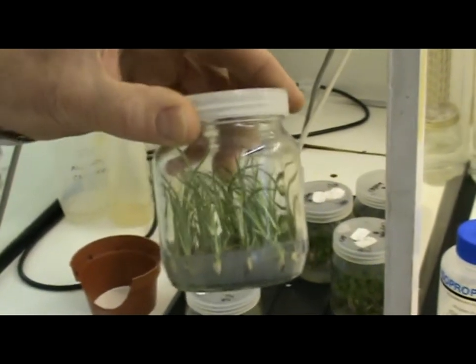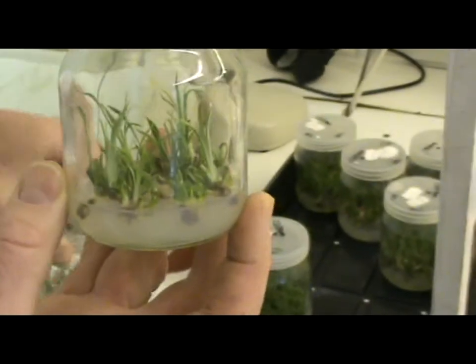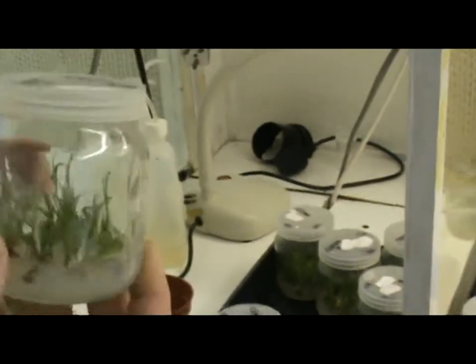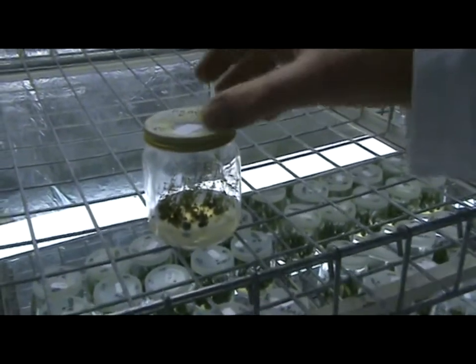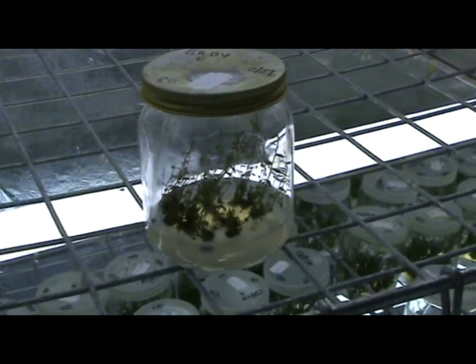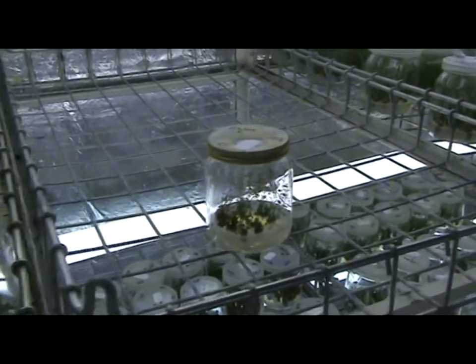I wonder if you could explain what the medium is. The medium contains everything plants need to grow, really. The normal fertiliser requirements that you'd feed plants in your garden, plus the trace elements that the plant would normally get from the soil. We also put into it vitamins and sugar because we want the plants to grow very quickly, and these are only pieces of plants, so we give them the vitamins and sugar and then they grow very quickly. And it's the presence of the vitamins and sugar that means we have to keep the thing sterile.